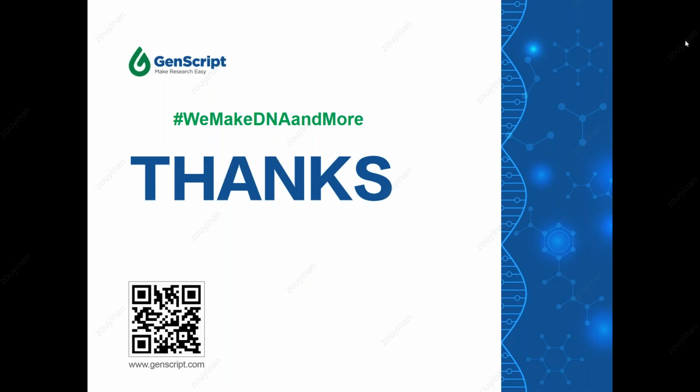First, we need to know whether you, as the customer, can provide a DNA template with the mutation pattern that you need for your library, and if so, we can just use your template for library construction. And if not, we want the customer to provide at least the template sequence to us for evaluation.